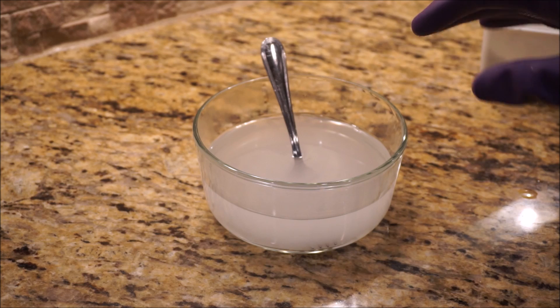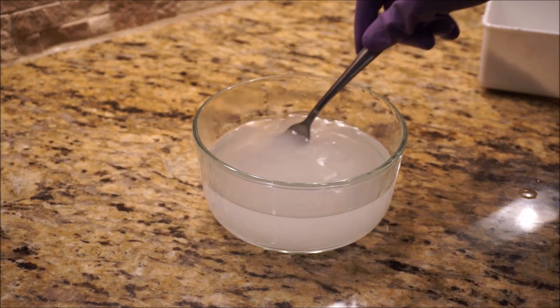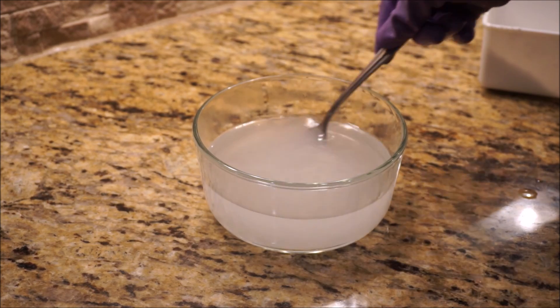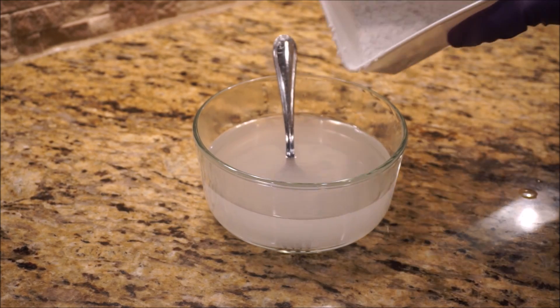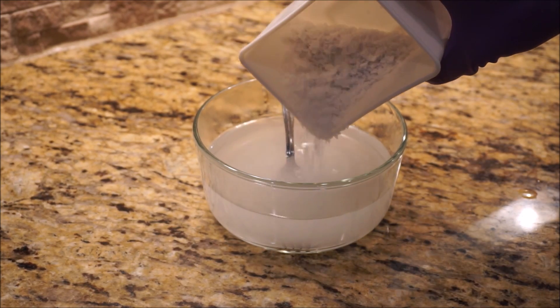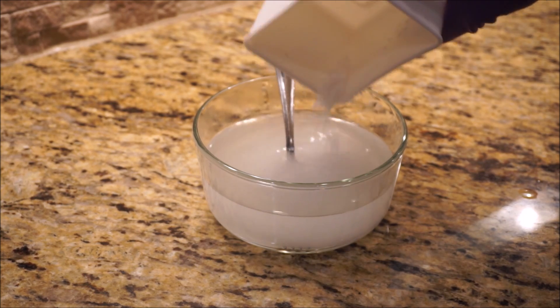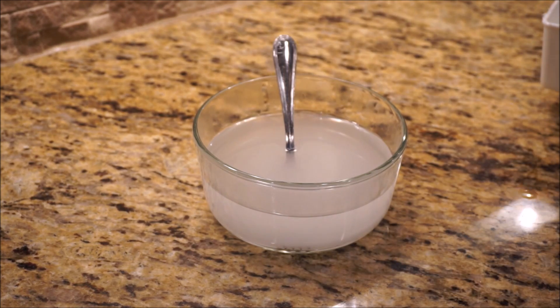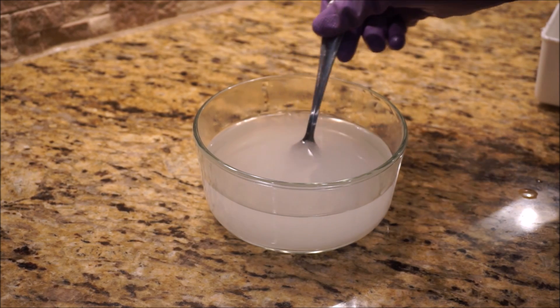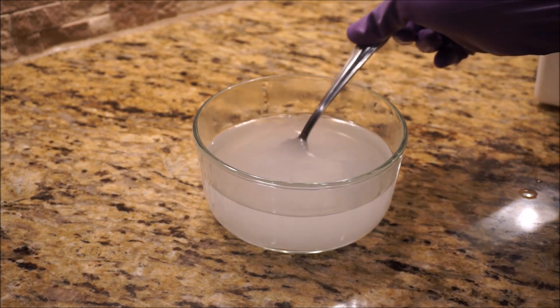I'm wearing hand protection, splash goggles, and a splash apron. You don't want to get any of this on you. Every time I pour it in — that is hot. My fork's hot.